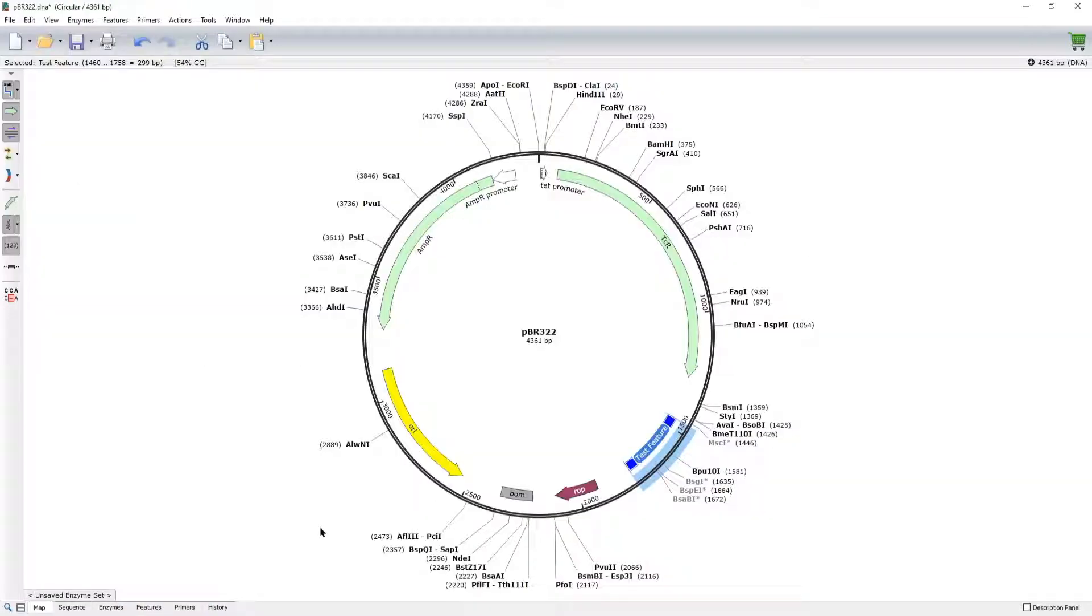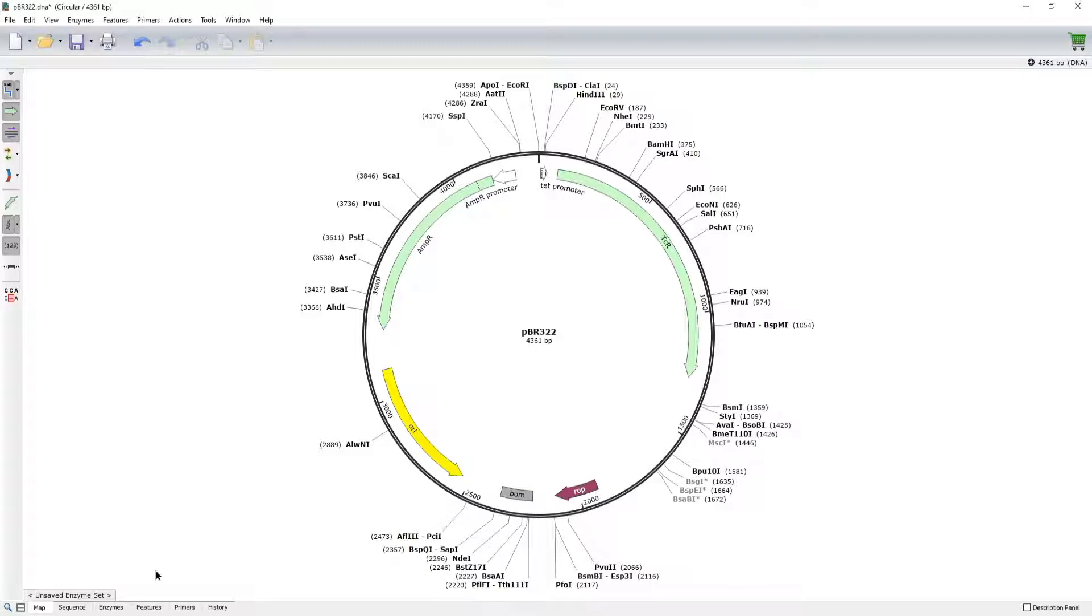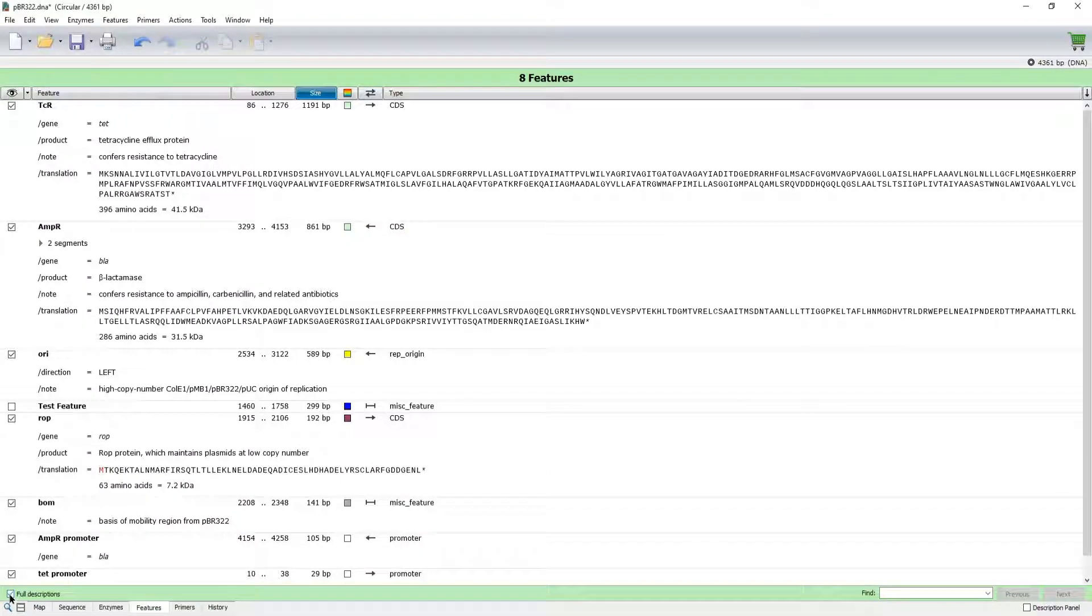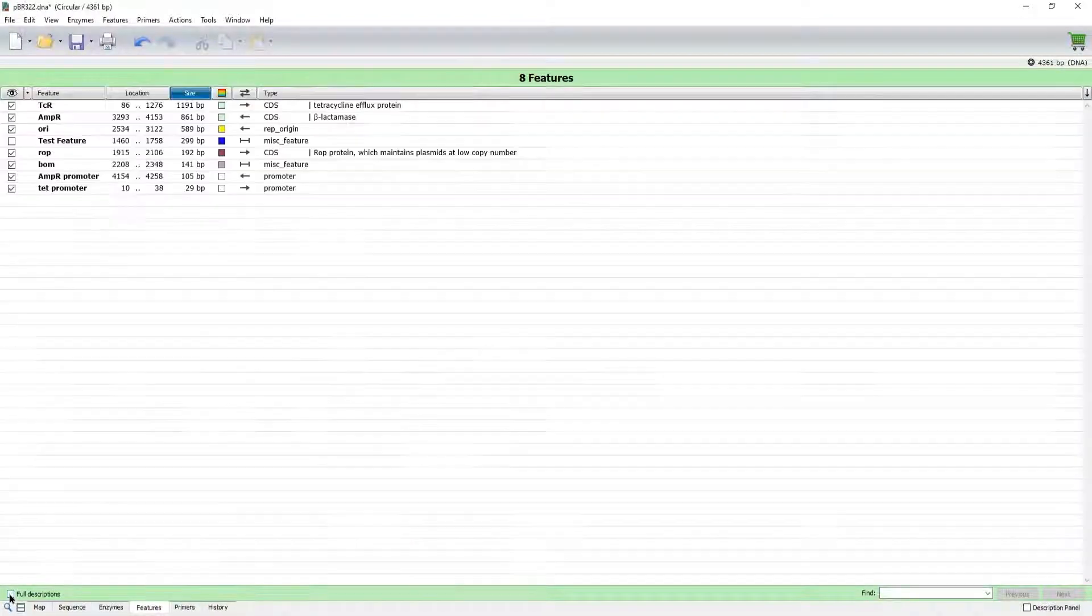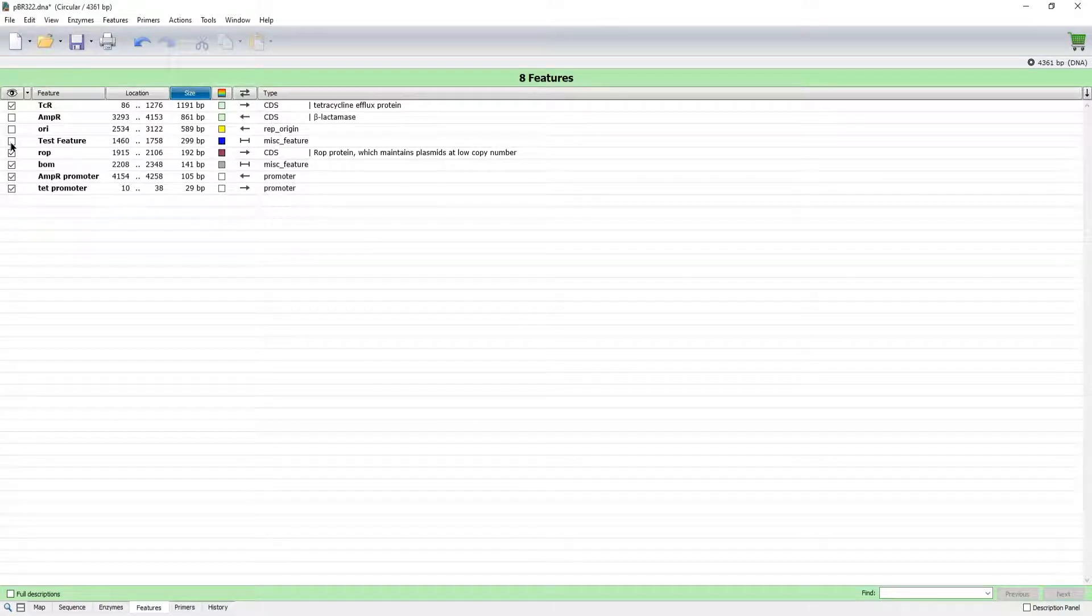As with enzymes, you can quickly toggle features on and off in both map and sequence view. To see a complete list of the features in your sequence, simply click the Features tab. Here you can sort features, toggle to a compact view, or simply hide individual features.